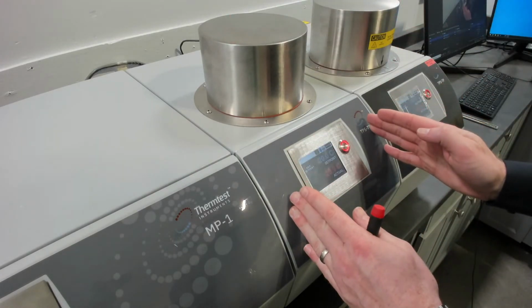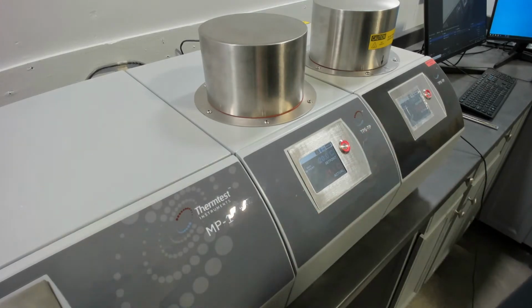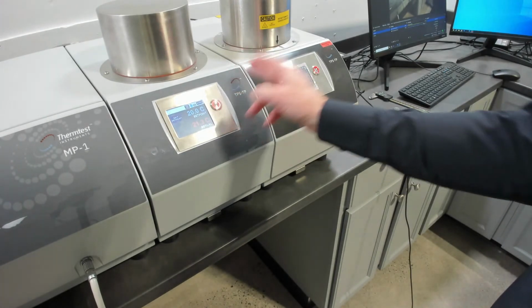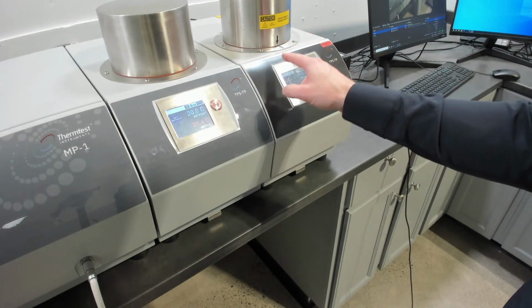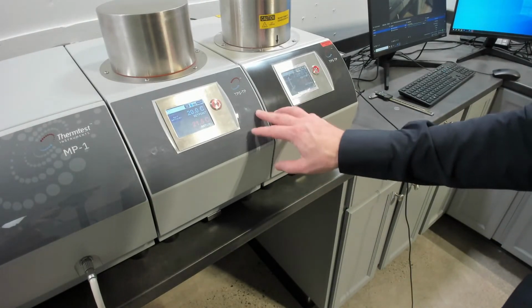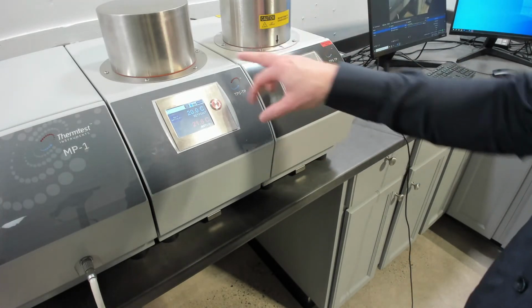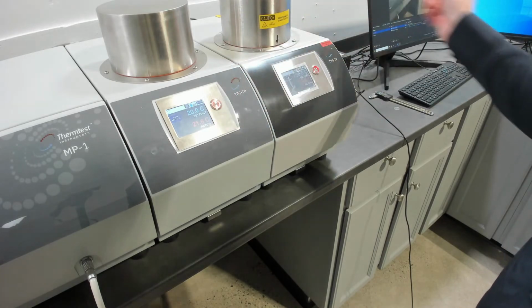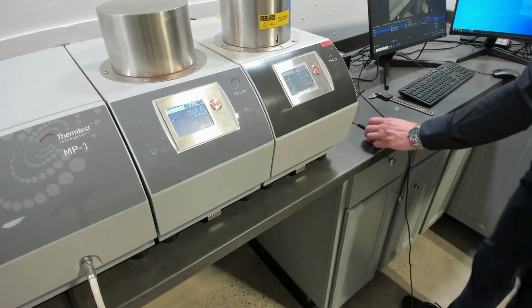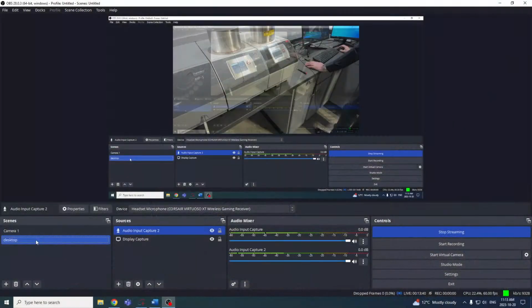That's ready to schedule a measurement in the software. So we'll go over to the software and schedule that. We have 2 set up here to show you that if you want to run 2 samples at different temperatures, you could actually add up to 4 of these. That would give you flexibility on running samples. Of course, with melt, you typically are measuring them all with a temperature range. That gives you flexibility to do that. So I'm going to share my desktop.